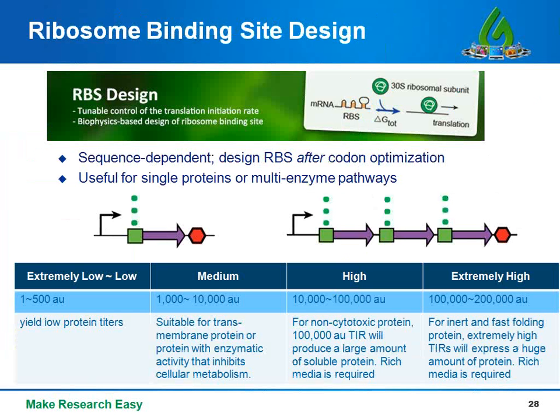Again, keep in mind that the RBS is sequence dependent. You have to design the RBS after you've decided on what your CDS is going to be, which means if you're going to do codon optimization to your CDS, you need to do the codon optimization first and then design the RBS for the codon optimized version. RBS design can be used for single proteins and also for multi-enzyme pathway optimization. And our technical account managers can definitely help you with your particular needs.